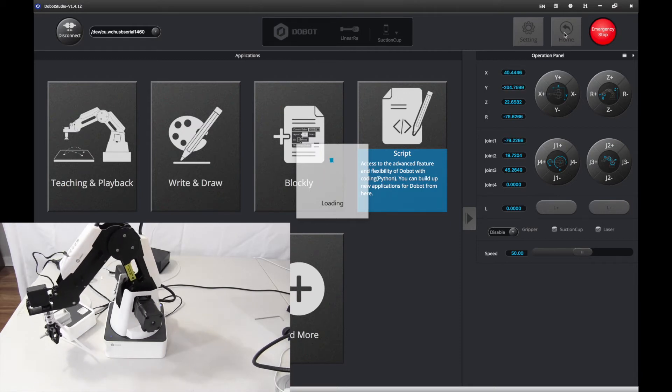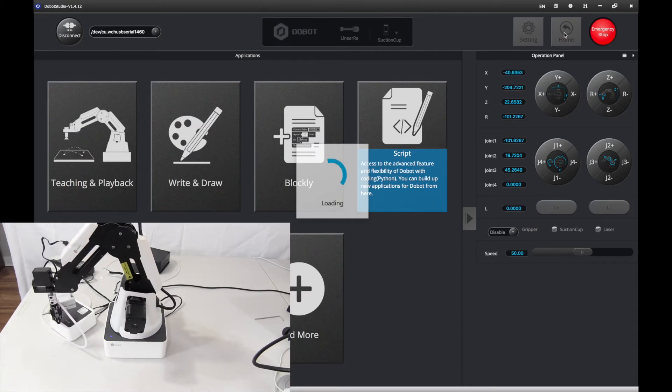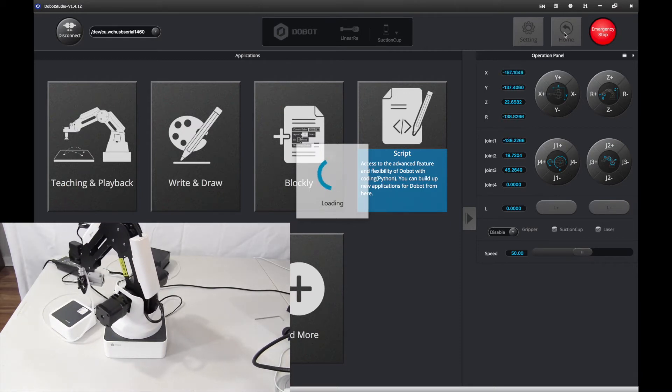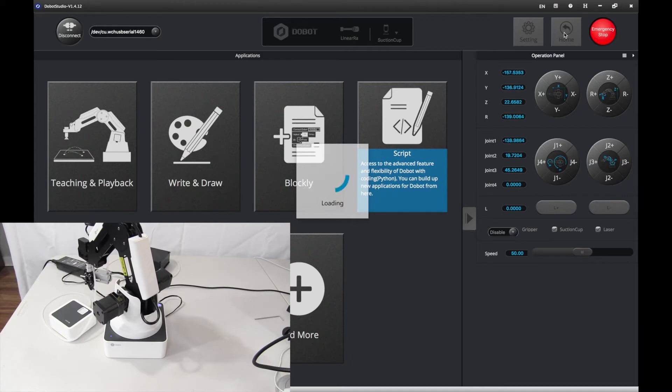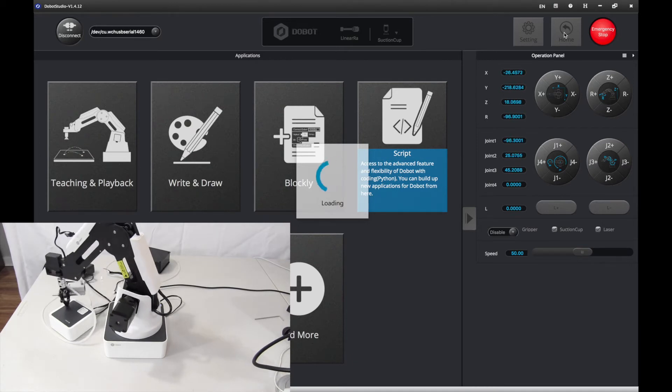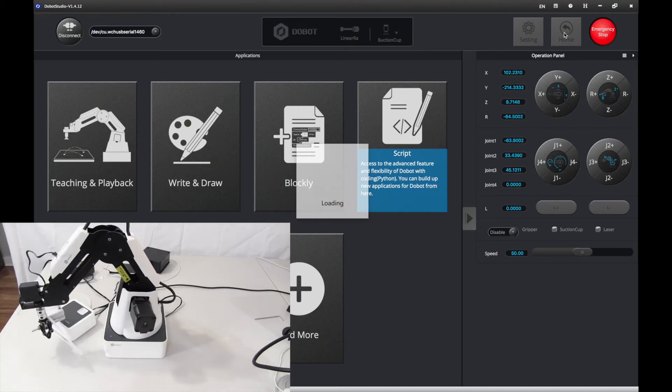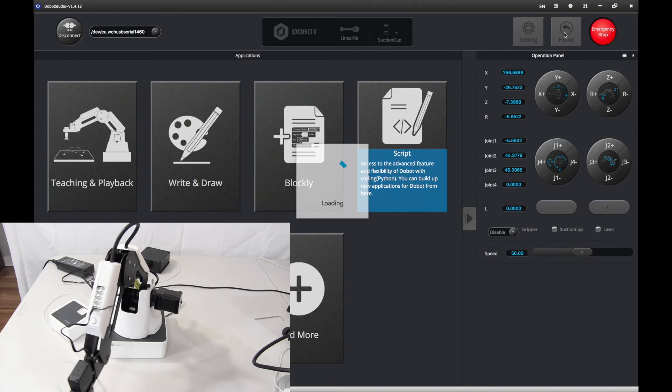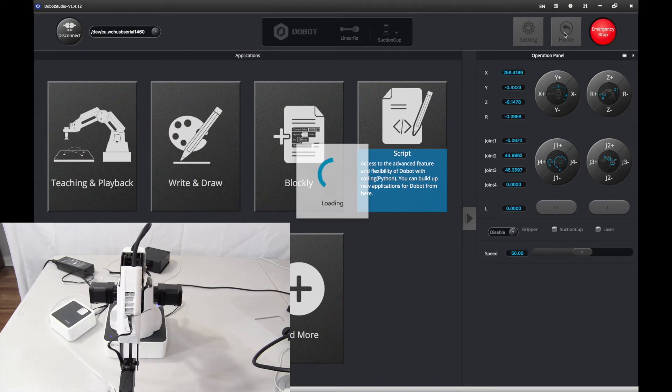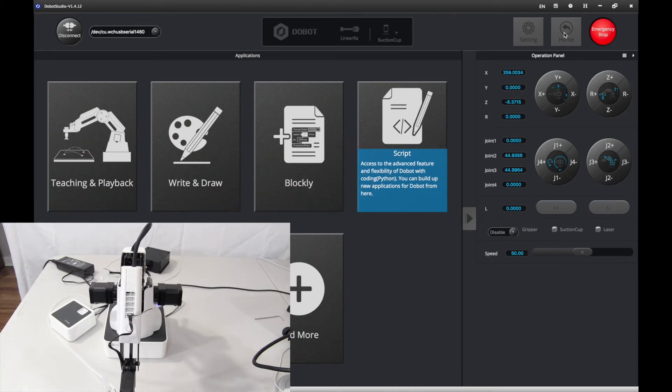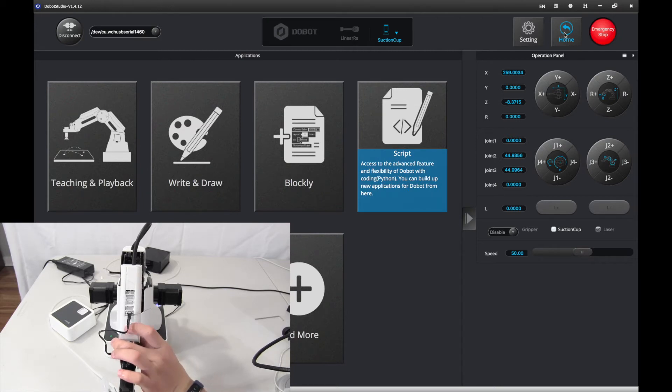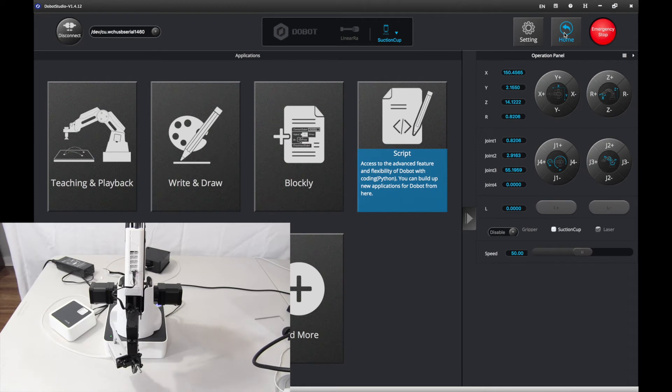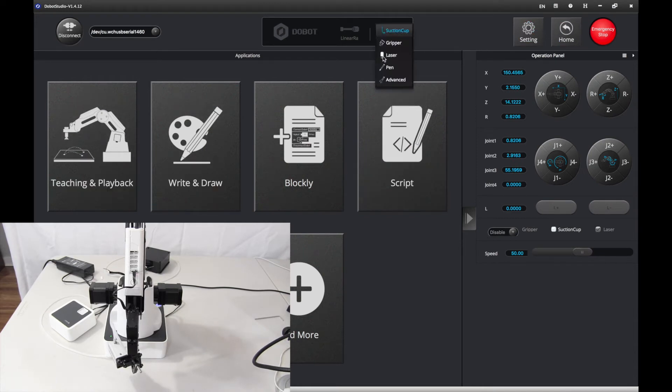You want to let it go home. There we are. Now, it has gone home. I'm going to move it here. And here, let's go and change the tool to gripper.